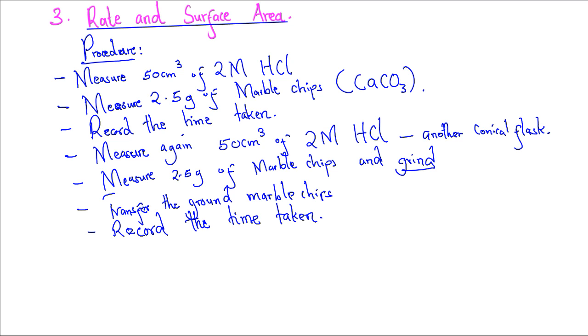If you look at those two experiments, they have the same reactants. The only difference is that one has unpowdered marble chips, while one has powdered marble chips. We have used the same amount of marble chips. We have used the same amount of the acid in question.